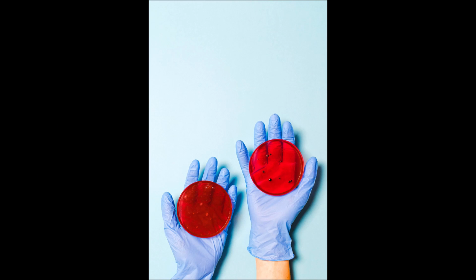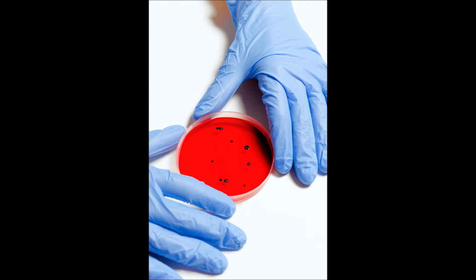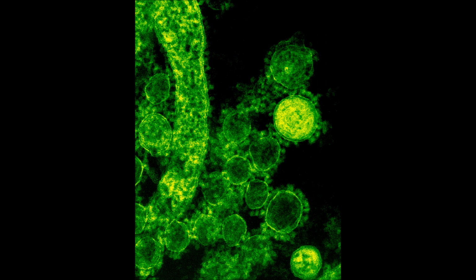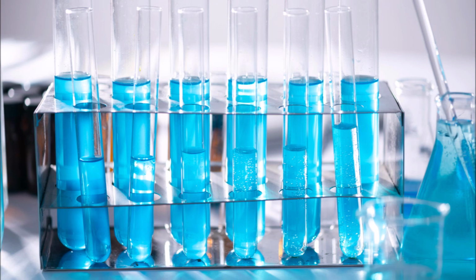Collecting microbiological samples from endophytes is crucial for studying their biodiversity, their applications in agriculture, and potential pharmaceutical uses. It's also used in microbiological research. This guide in this video explains the proper techniques for collecting, isolating, and preserving endophytic microorganisms from plants.